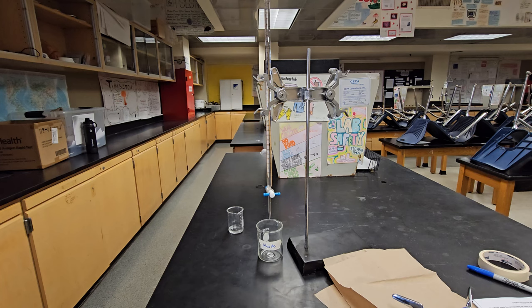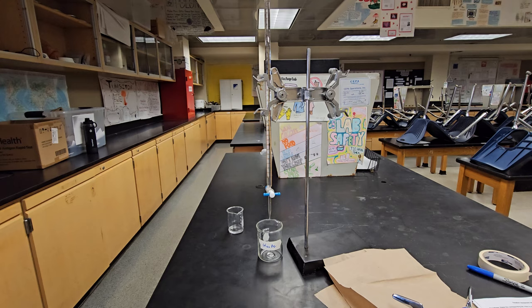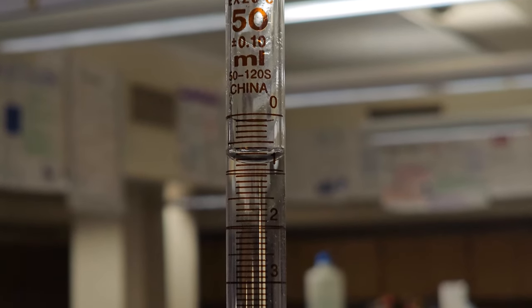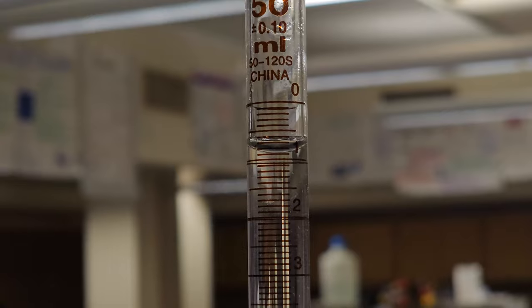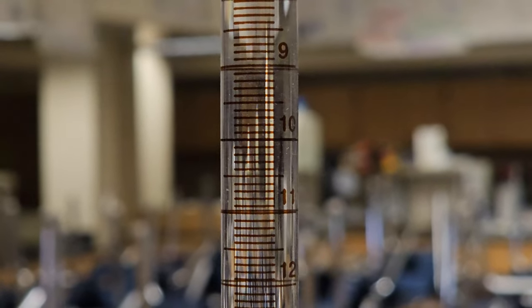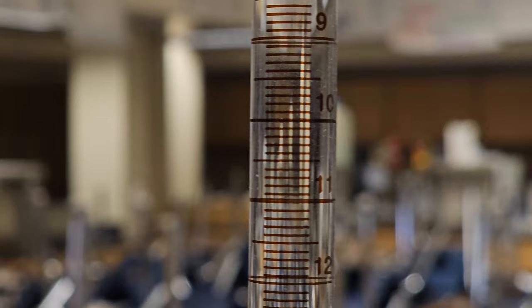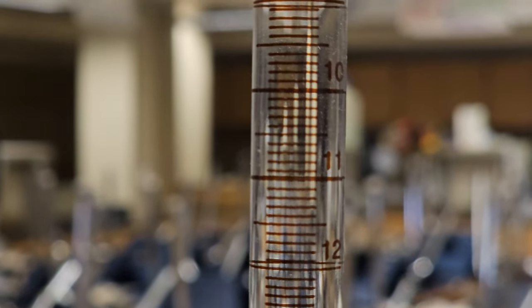Now wait one minute with the valve sideways to make sure the burette is not leaking. If it is leaking, inform your instructor — they'll fix it or give you a new burette. What you're going to practice today is draining your burette in very specific increments. Since the burette water level is at 0.8, practice getting it down to 10.8 — that's exactly 10 milliliters. Everyone in your lab group will need to do this, as you'll all be assessed on it.